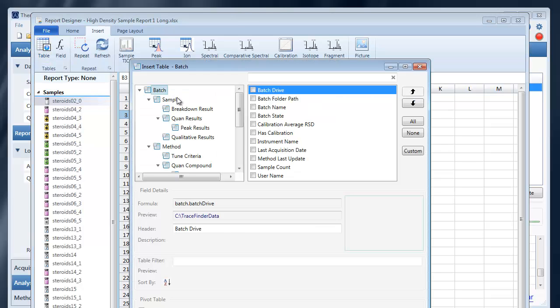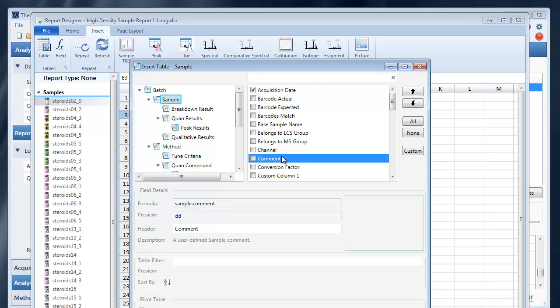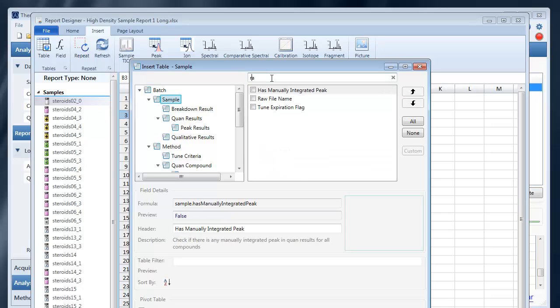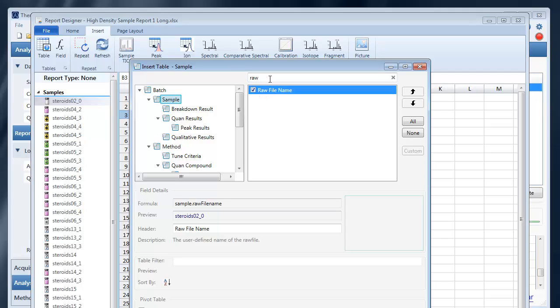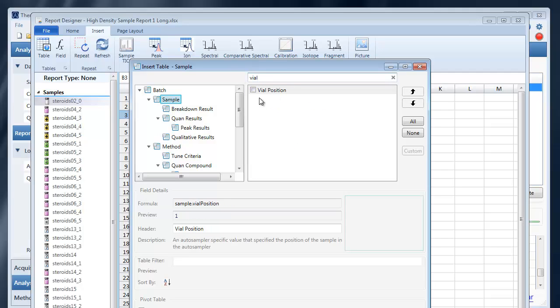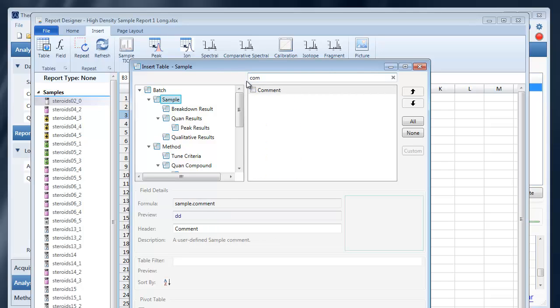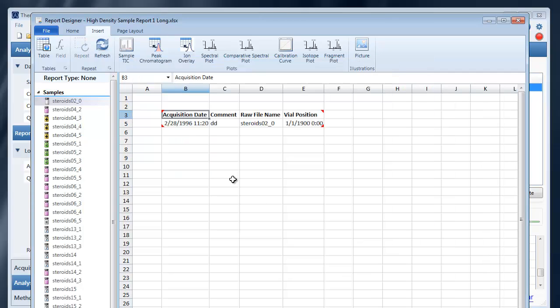So, say I wanted to list out all the samples in my batch and display the sample raw file name, the file position, any comments. And I can go ahead and insert those into my report.